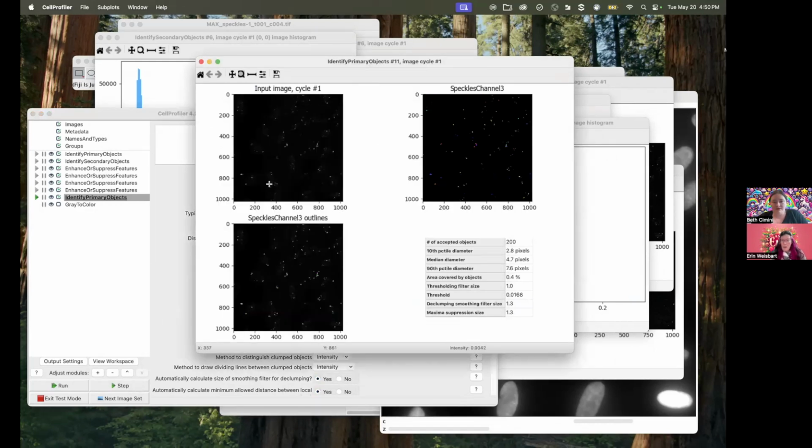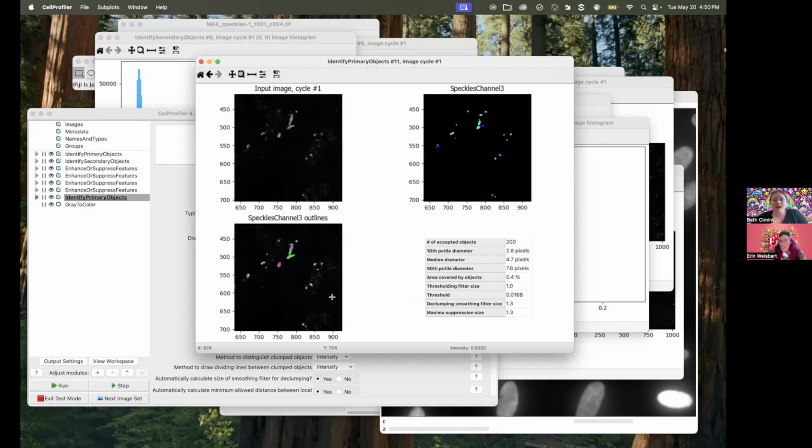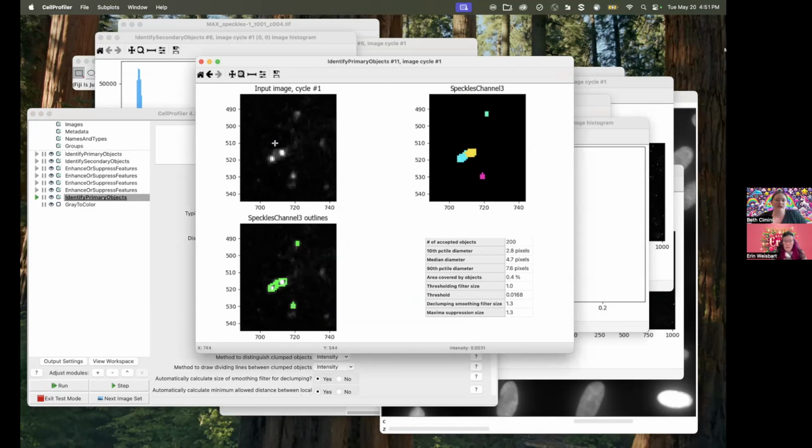Great. Beth, would you ever bump the outlier fraction? Yes, potentially. If you know that your image has some autofluorescence or some crud in it that you really want to work around, you can change that outlier fraction. More often than not, though, what I have found is if you're in a regime where you're changing the outlier fraction, that means enough of your image is signal that you should probably just switch thresholding methods.